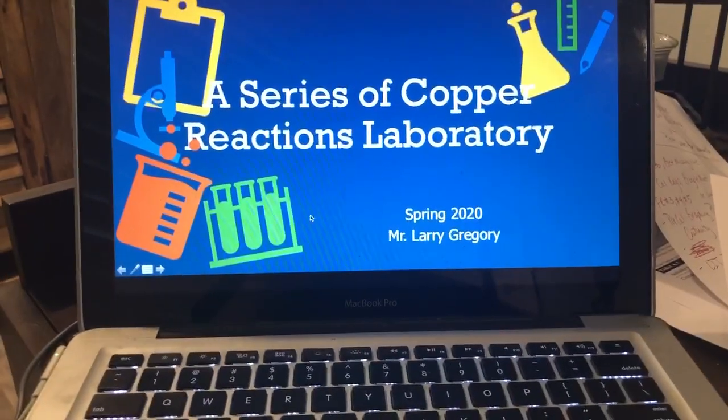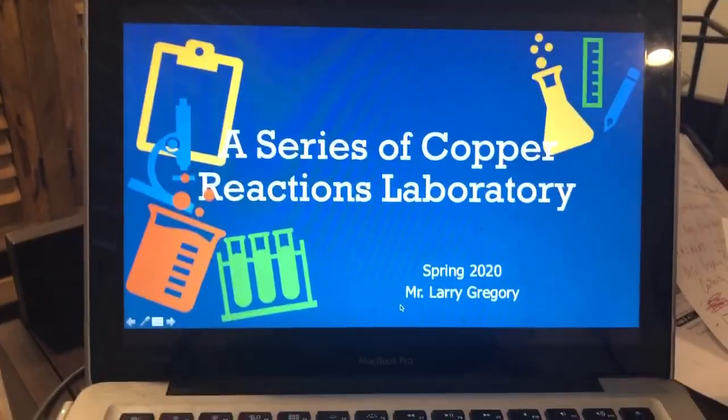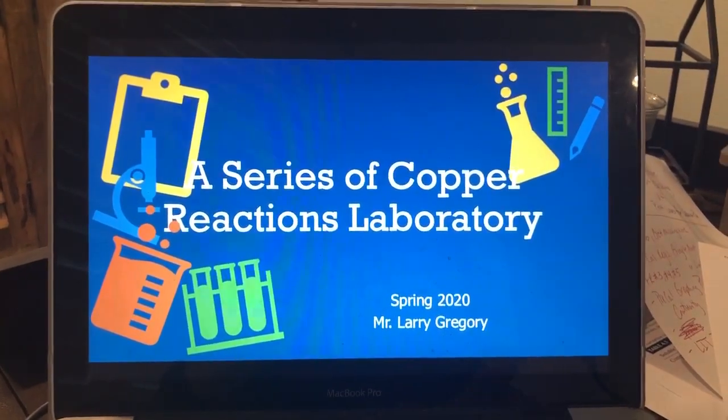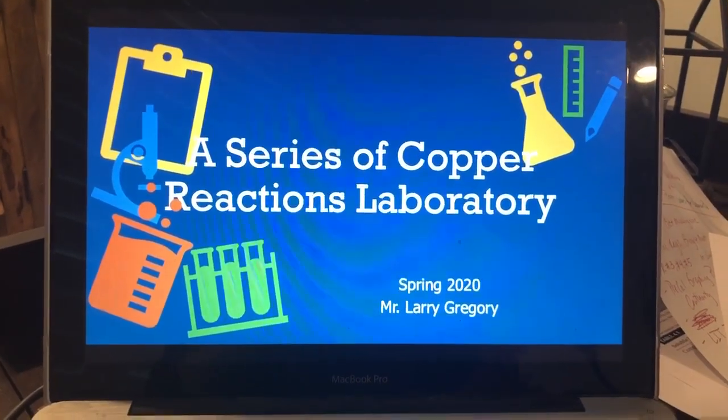Okay guys, so this is going to be the series of copper reactions lab. What I'm going to do is step through this as we go and explain a few things, and then I'm going to go to the lab paper and show you how to do your calculations and your balanced equations and all that good stuff.